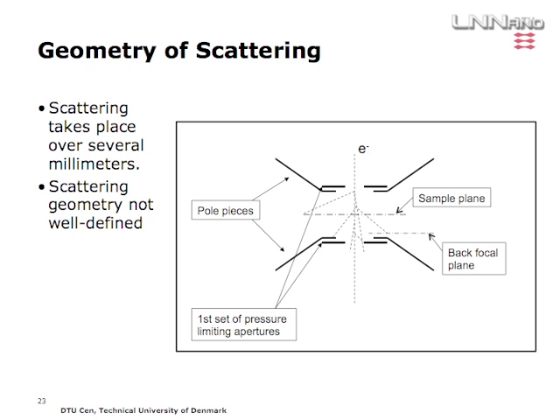Now, there's one thing that we haven't considered here. When we look at a conventional sample, it's always sitting at the eucentric plane of the objective lens. That's not the case for the gas. It's spanning the entire pole piece gap. So you basically have scattering of your gas molecules throughout the pole piece gap here. I'm not going to get much further into this because honestly, we have no clue what's going on. We're trying to find out how exactly this affects resolution at the moment. But just so you know, your sample is no longer a thin sample. It's spread out over quite a big gap.